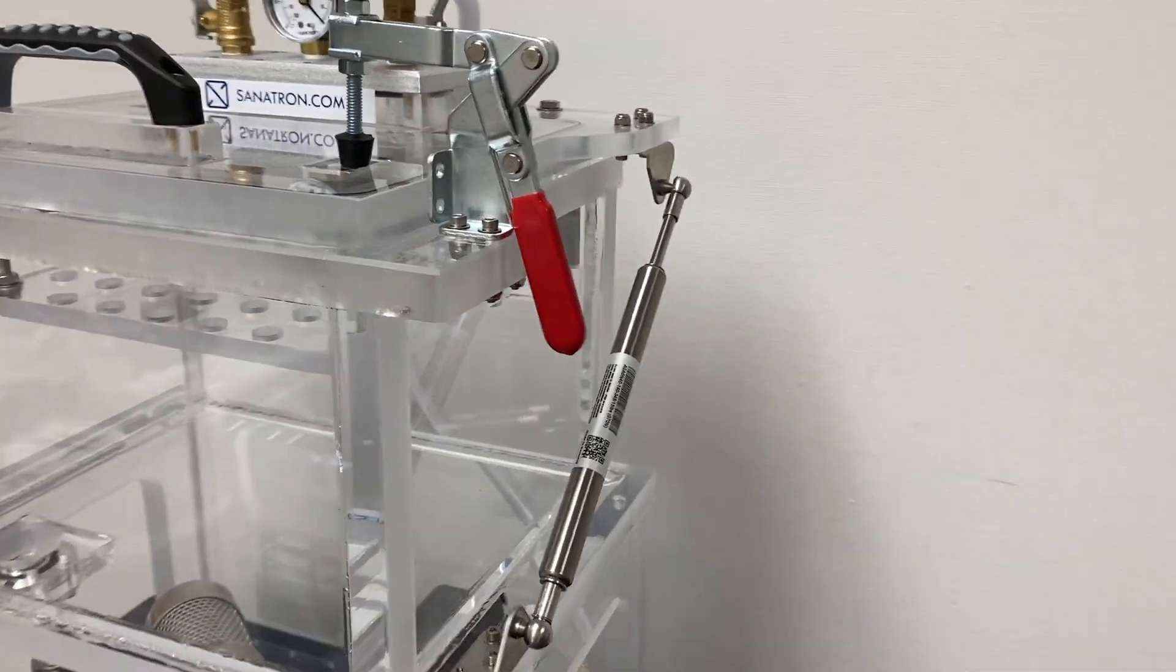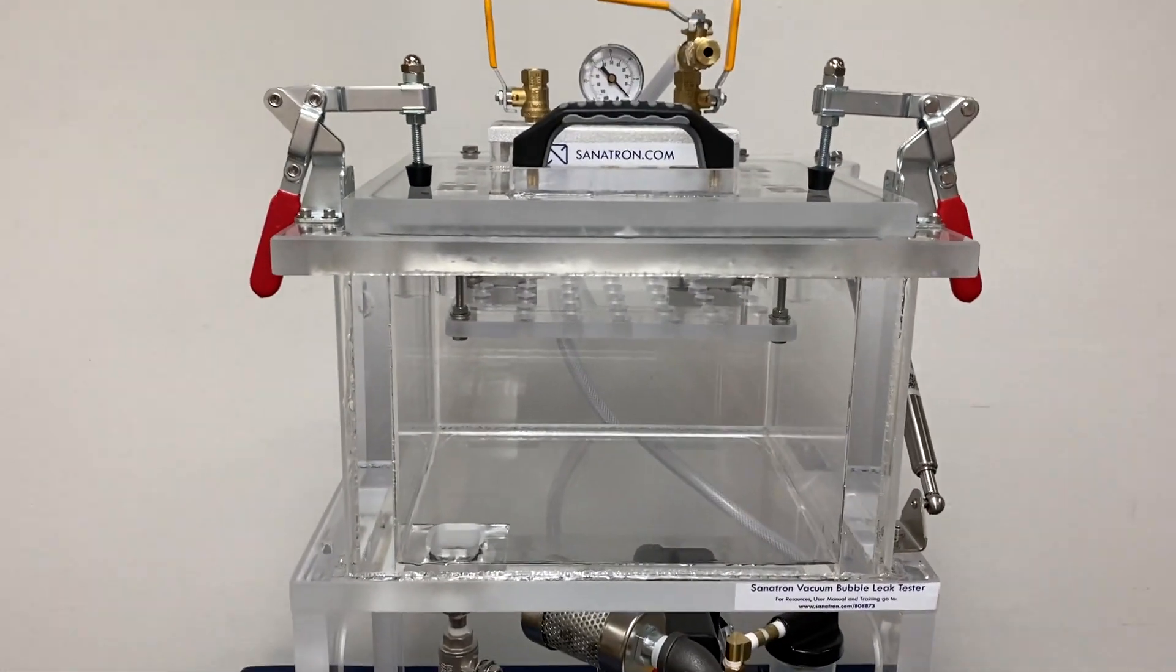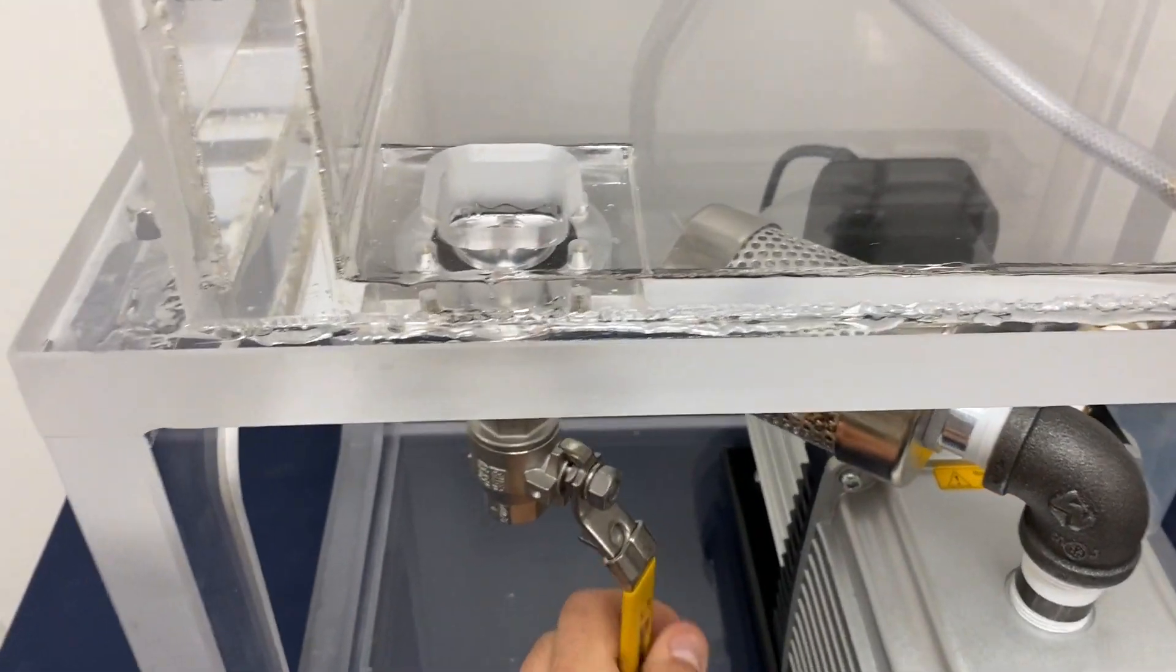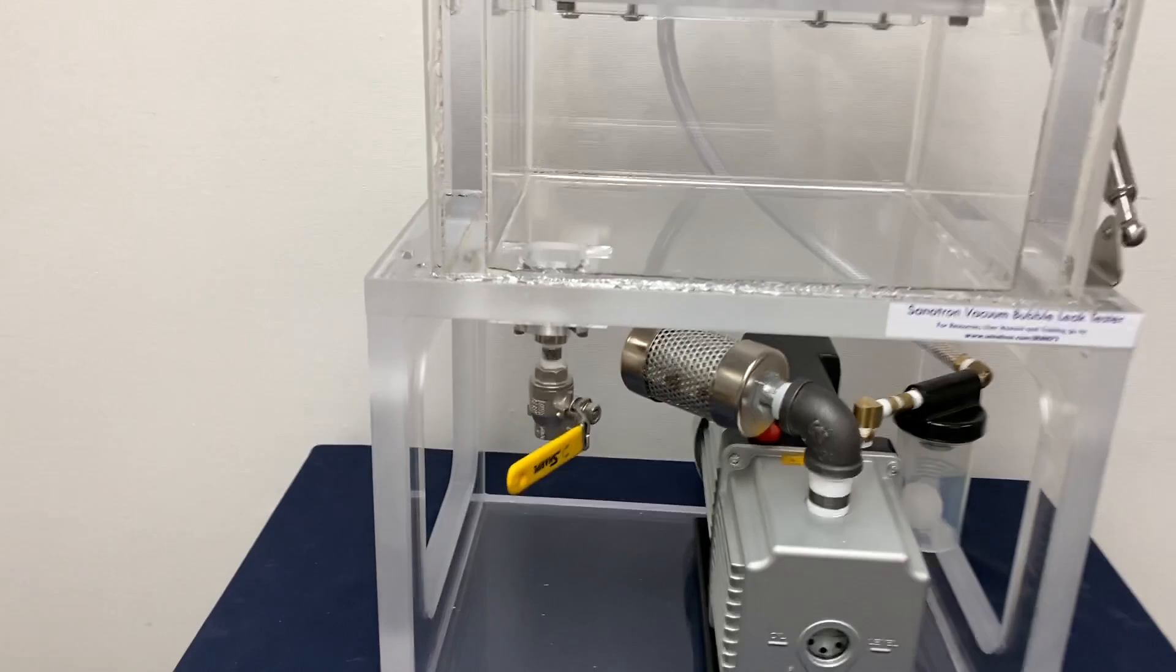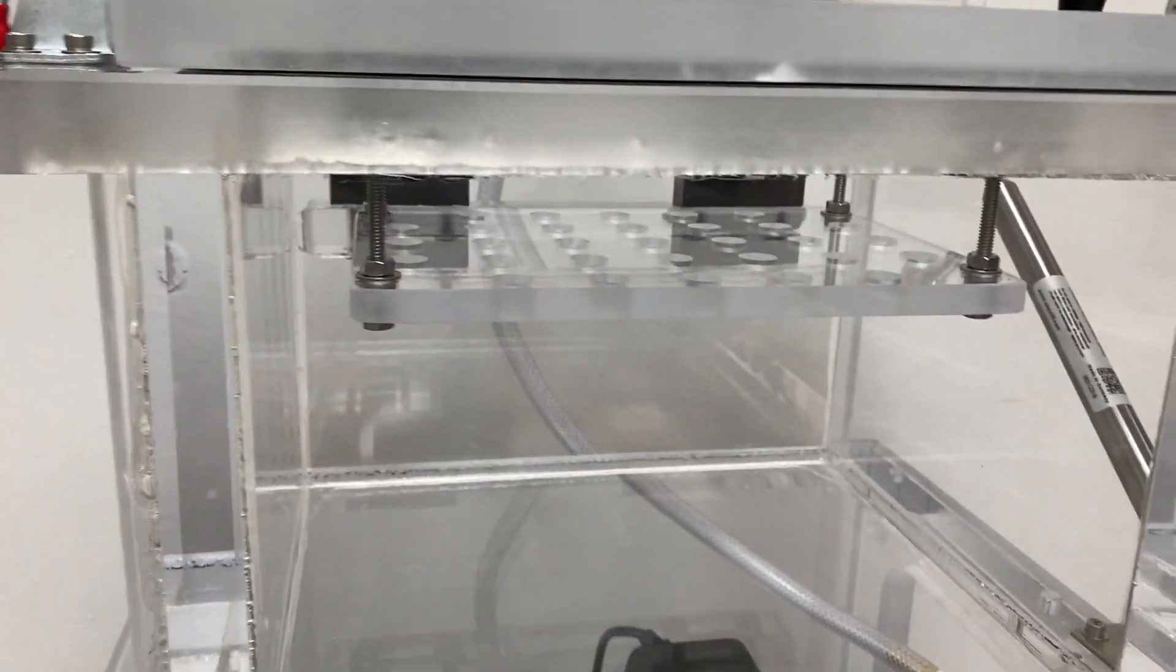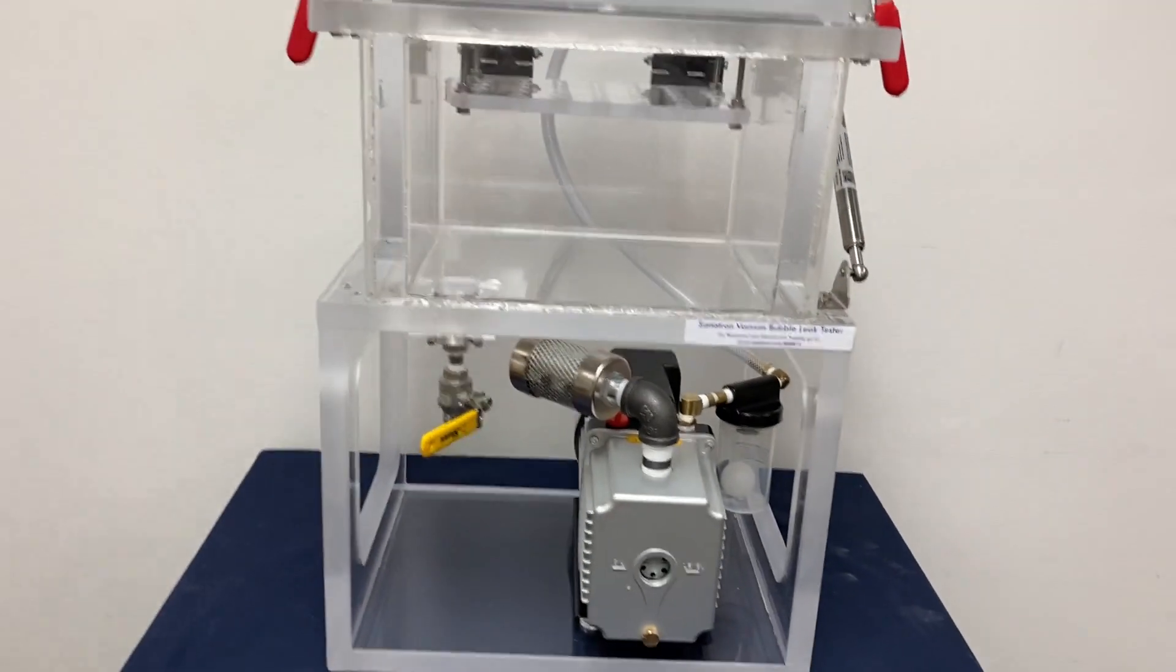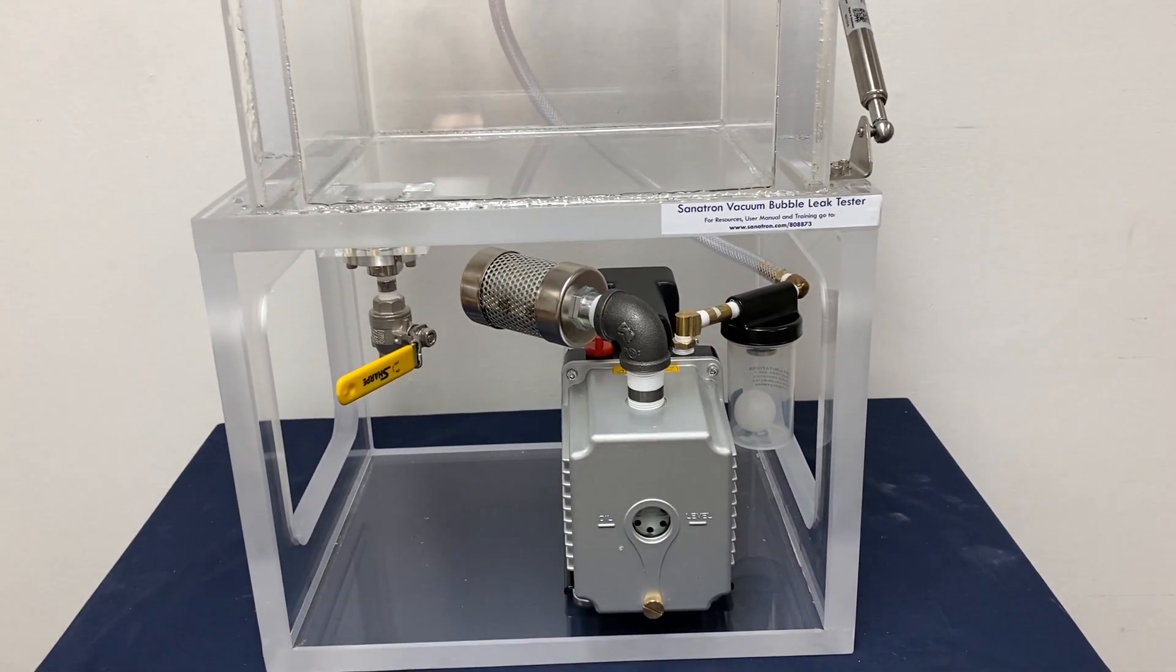Here we have a drain valve. This valve will drain the water that you fill into this chamber when you're done with it. Furthermore, this particular system comes with a rotary vane vacuum pump rated to about 15 micron.